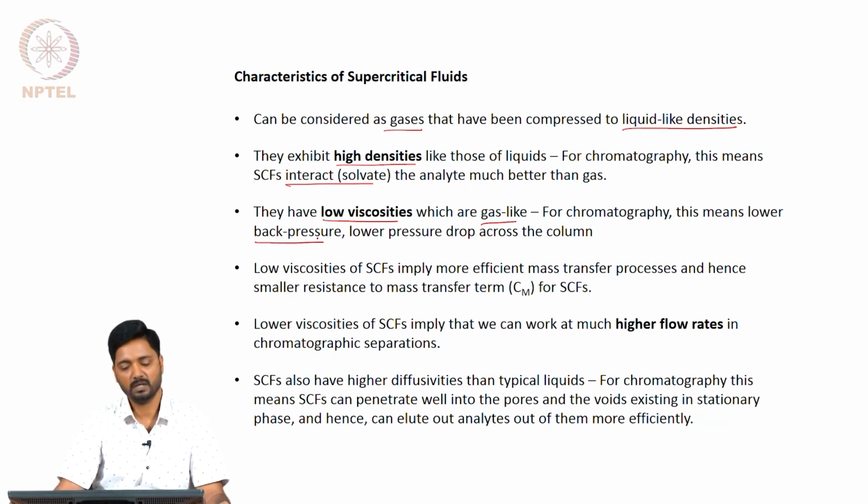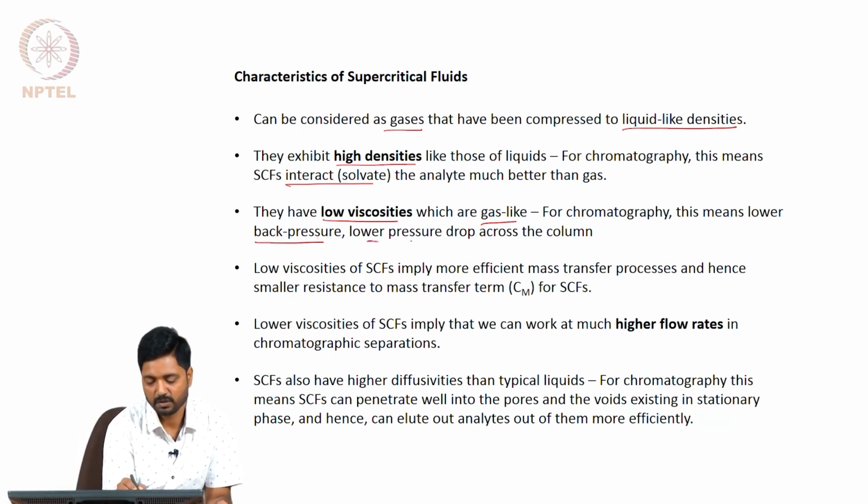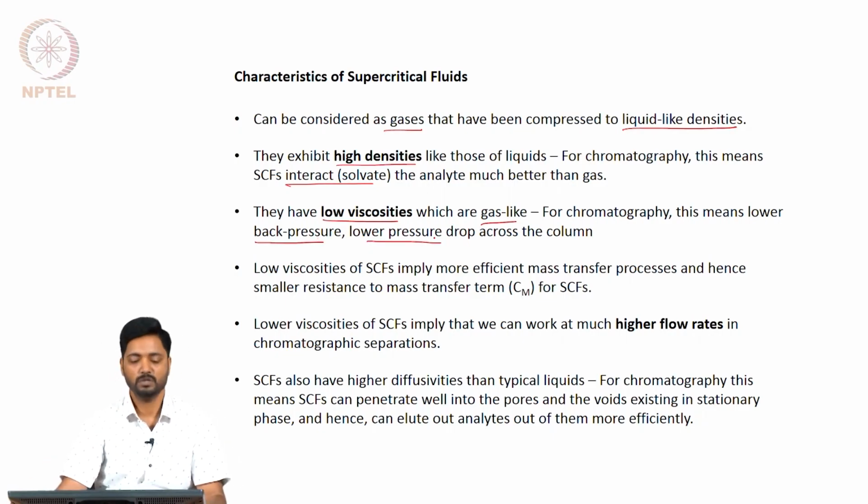They also result in lower pressure drops across the column.